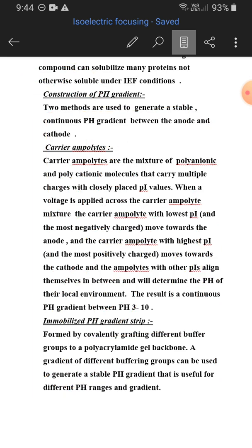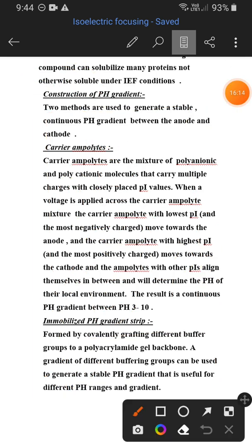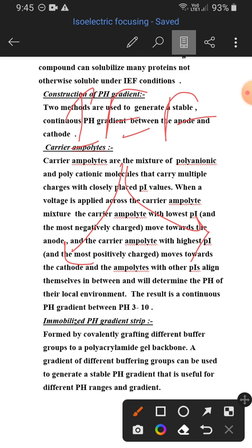Okay, so now we have two kinds of isoelectric focusing, IEF. One is native isoelectric focusing. As the name suggests, here we are keeping the protein structure and biological activity intact, right? But native IEF is not used widely. Why? Because in native IEF, most of the proteins are not soluble at low ionic condition or at a pH value which is very close to their pI.